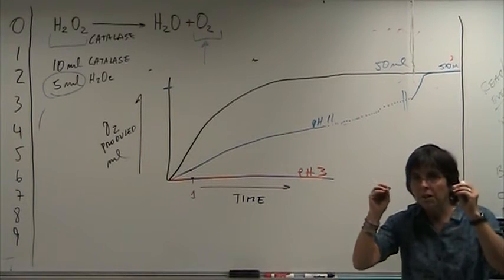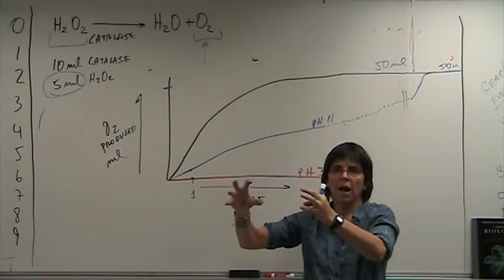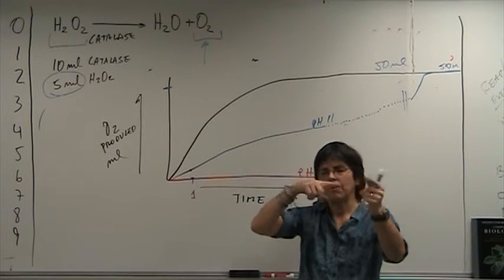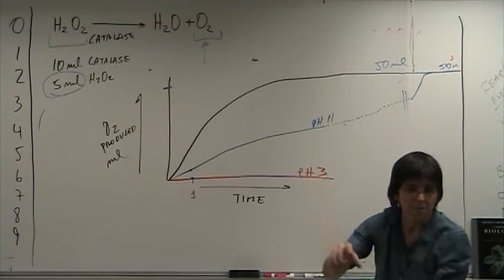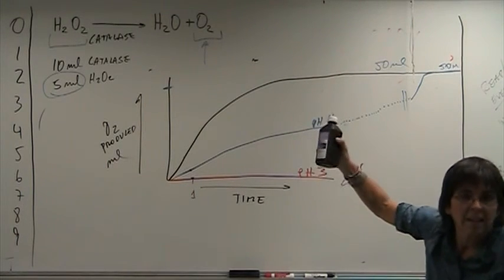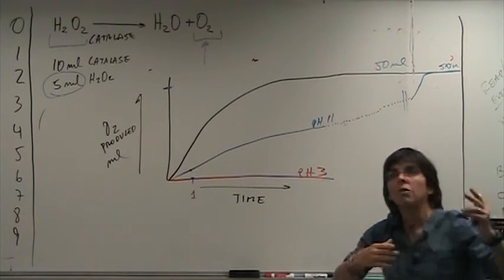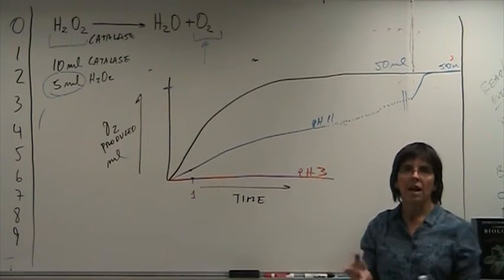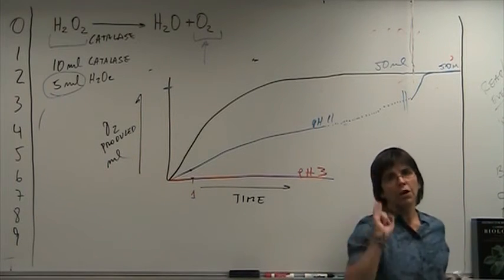So that's an important concept. You start with the same substrate, hydrogen peroxide, you should get the same amount of oxygen, if you let the reaction go long enough so all the hydrogen peroxide is destroyed. Good? Now, food for thought.